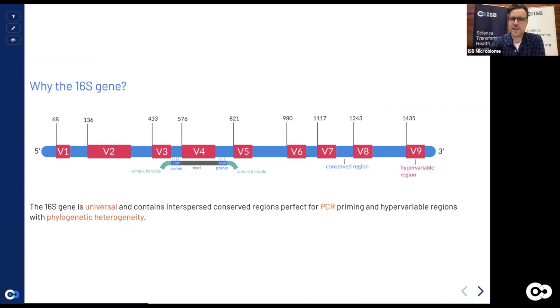And why is that actually a perfect gene? Because it has exactly that design that we wanted. It is a pretty conserved protein for the most part, but it has those really hyper variable regions interspersed into it. You could explain it with, for a bacterium, depending on the environment, the way the bacteria initiate translation, and with what velocity, it's obviously very organism specific. So you will have those variations there that dictate how you initiate that.